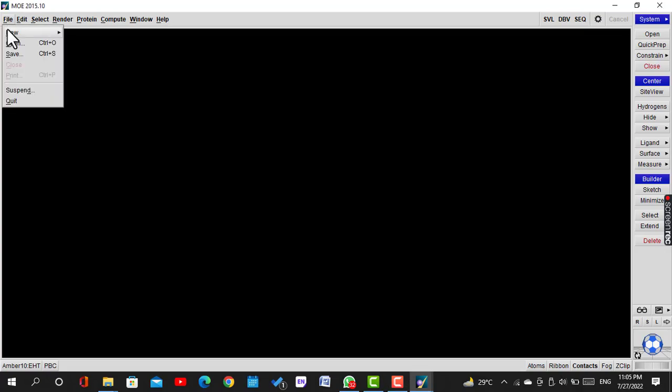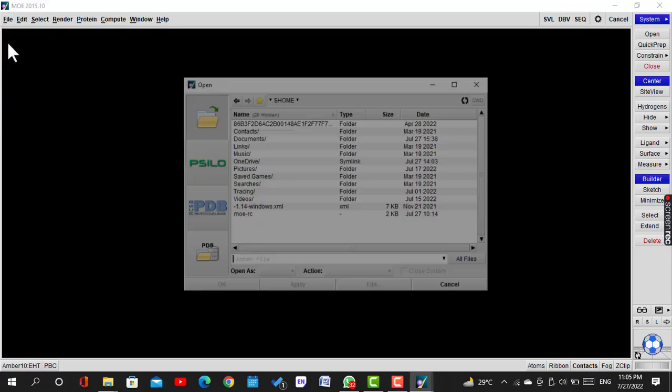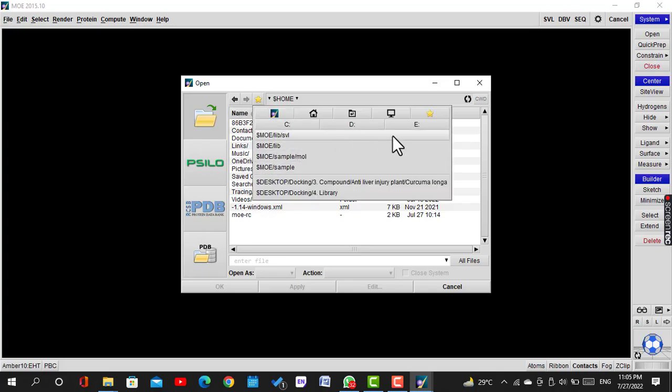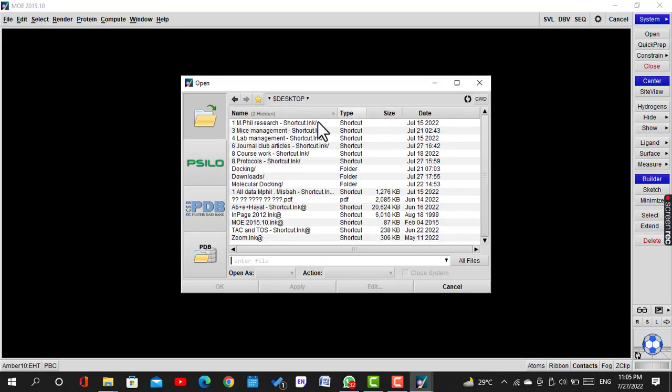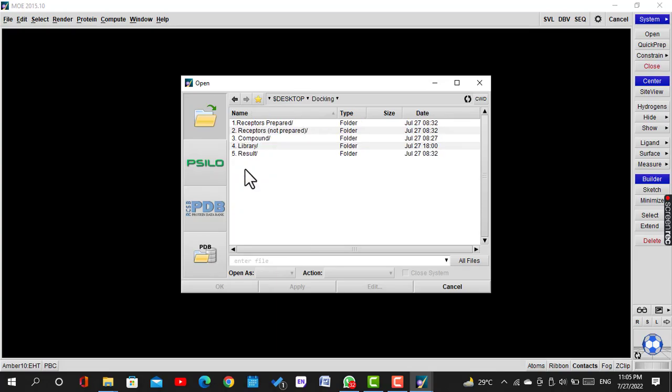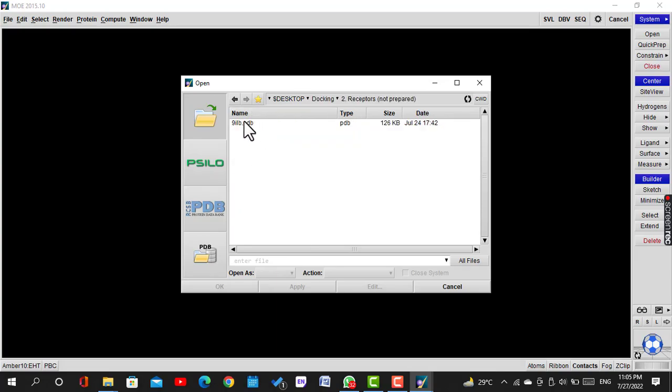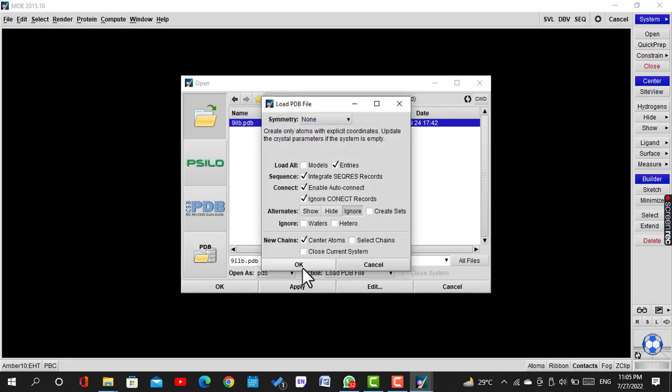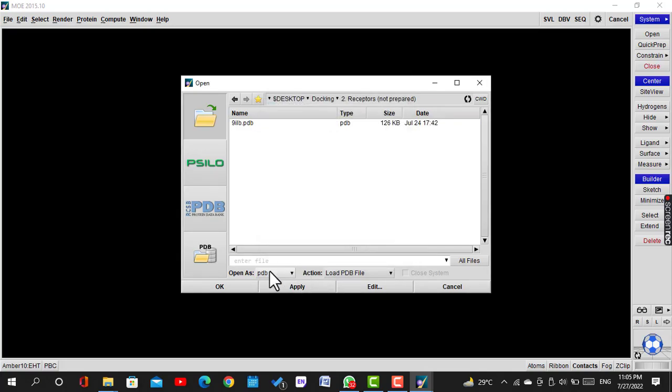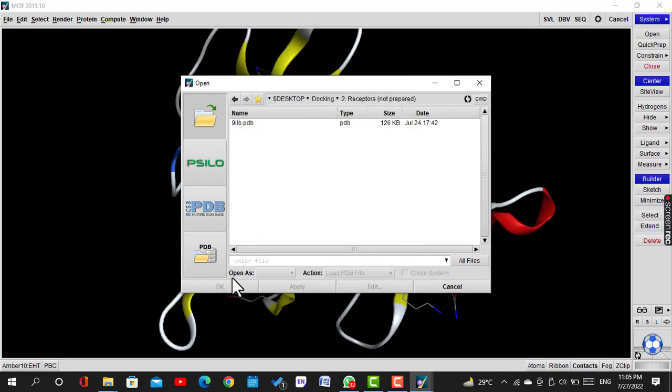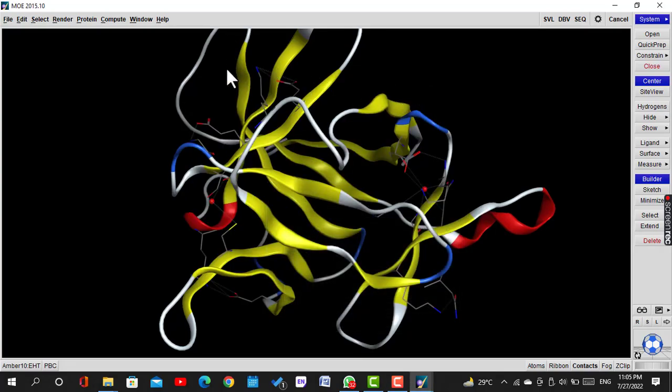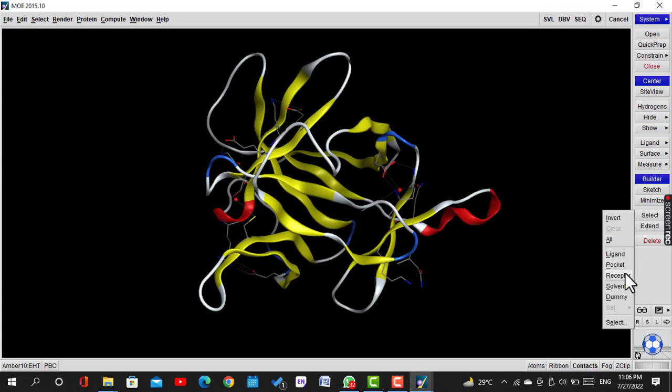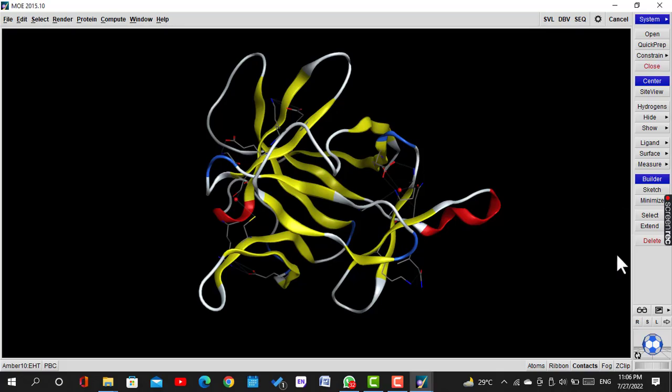Now we will click on File, Open, and select the receptor protein. Click on Apply. Now in the side menu of MOE, click Select then Ligand, and click Delete from the keyboard.